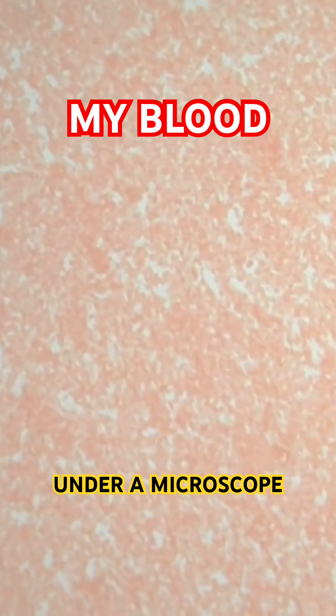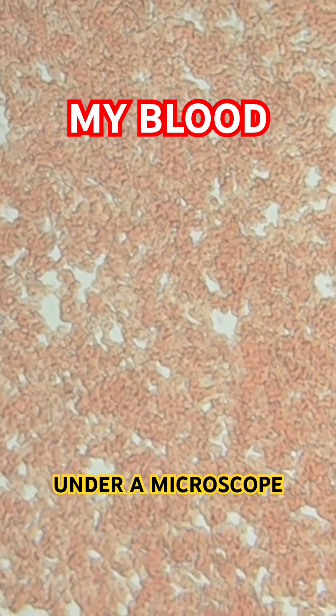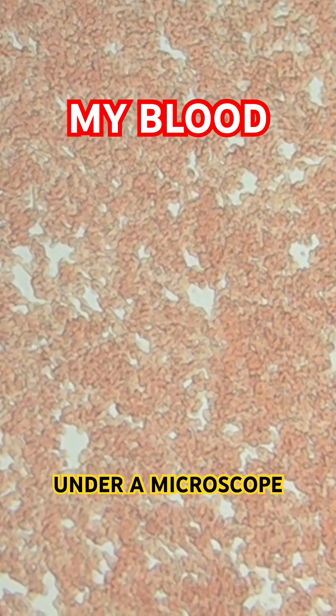Let's bring it along towards the sun. Now we're gonna go to 100 magnification. Still can't really see much though. Wait, let's go around — take this away.